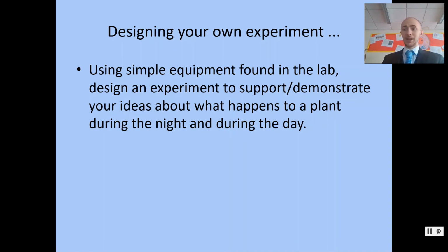So we're going to think about that if we're going to use the animals. But you're going to set up an experiment where you've got the indicator in a place where the plants are also there and the animals are also there in places. You're going to find out how changing the night, changing the day is going to affect that.